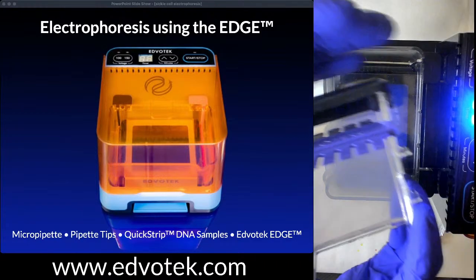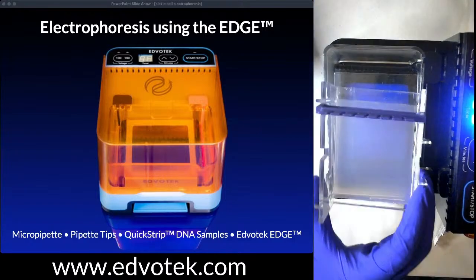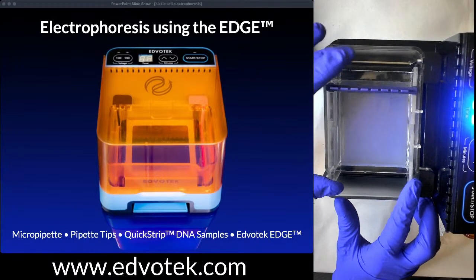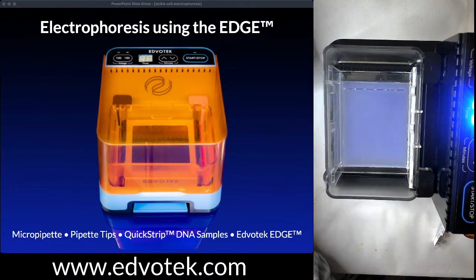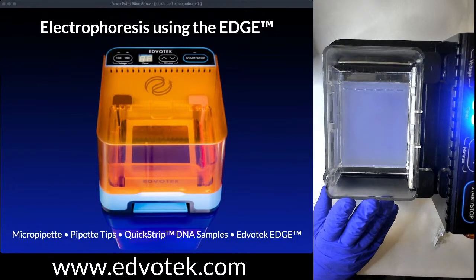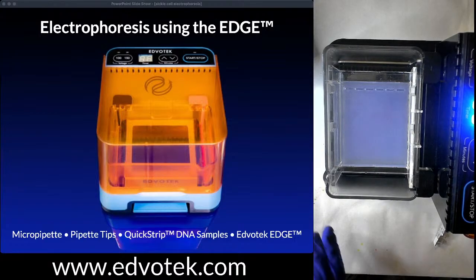So I've actually already added SYBR Safe to our gel. SYBR Safe is an important addition to our electrophoresis experiments. It is going to allow us to visualize our DNA. Our DNA is clear and colorless, and so we need a way to see it. And so this electrophoresis system is actually optimized to use with SYBR Safe because of the blue light system, which excites the SYBR Safe and allows us to visualize the DNA.